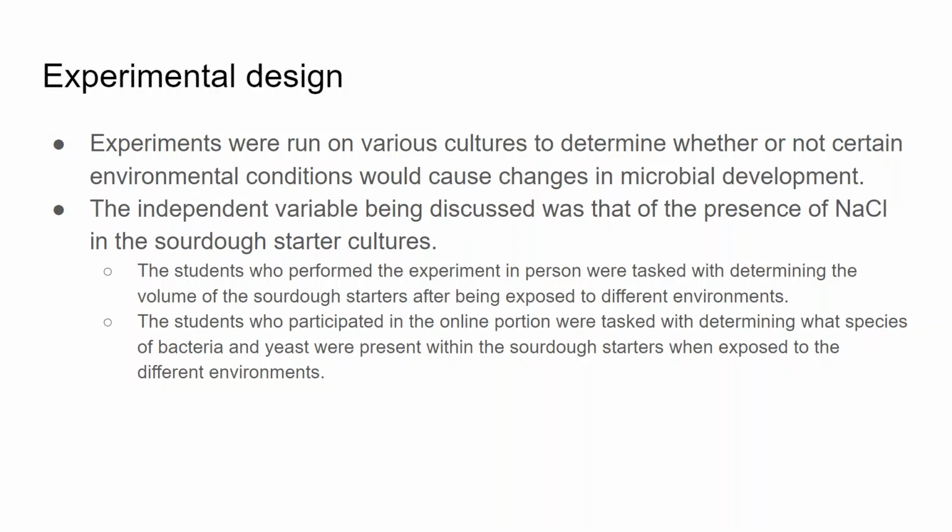The experiments were run on various cultures to determine whether or not certain environmental conditions would cause changes in microbial development. The primary environmental change of note was the presence of NaCl, table salt, in the sourdough starter cultures. The students who performed the experiment in person were tasked with determining the volume of the sourdough starters after being exposed to different environments. This was whether or not they were in the presence of sodium, whereas the online students who participated in the online portion were tasked with determining what species of bacteria and yeast were present within the sourdough starters when exposed to different environments.